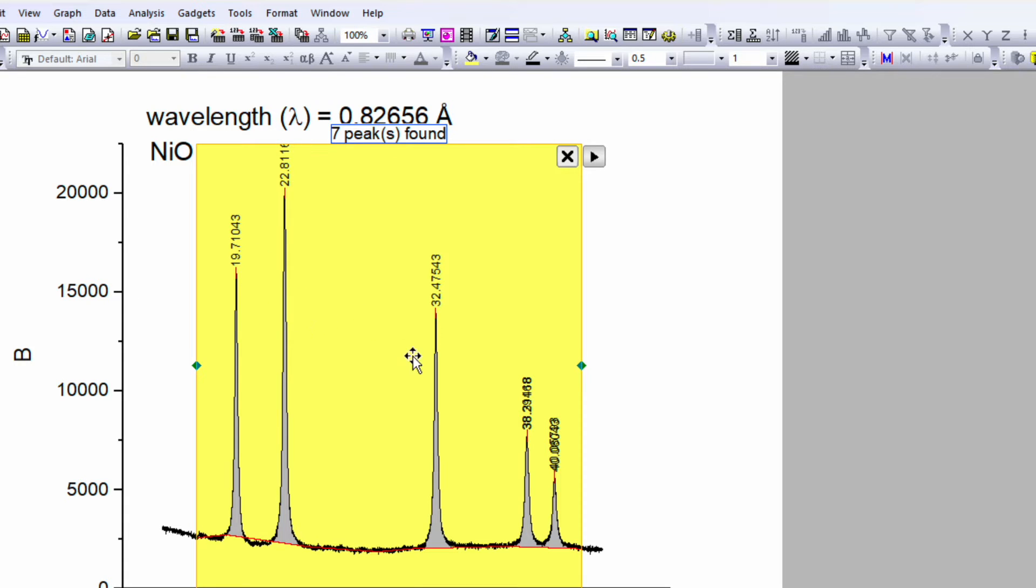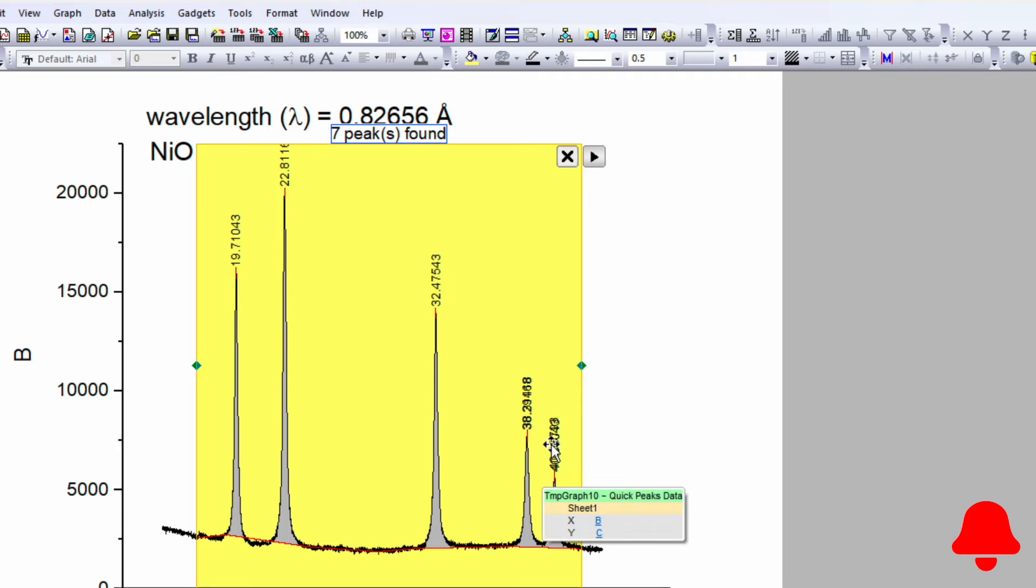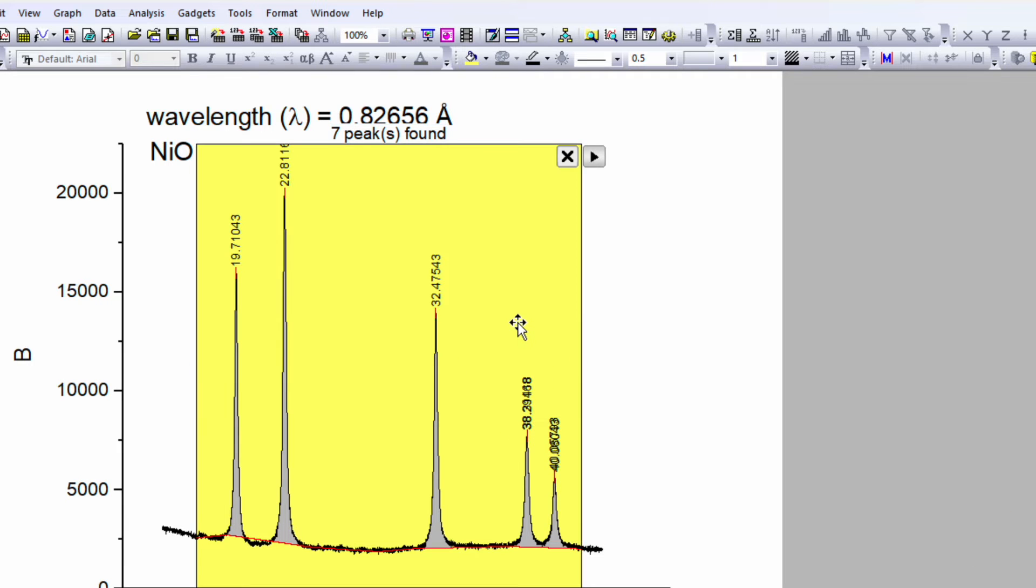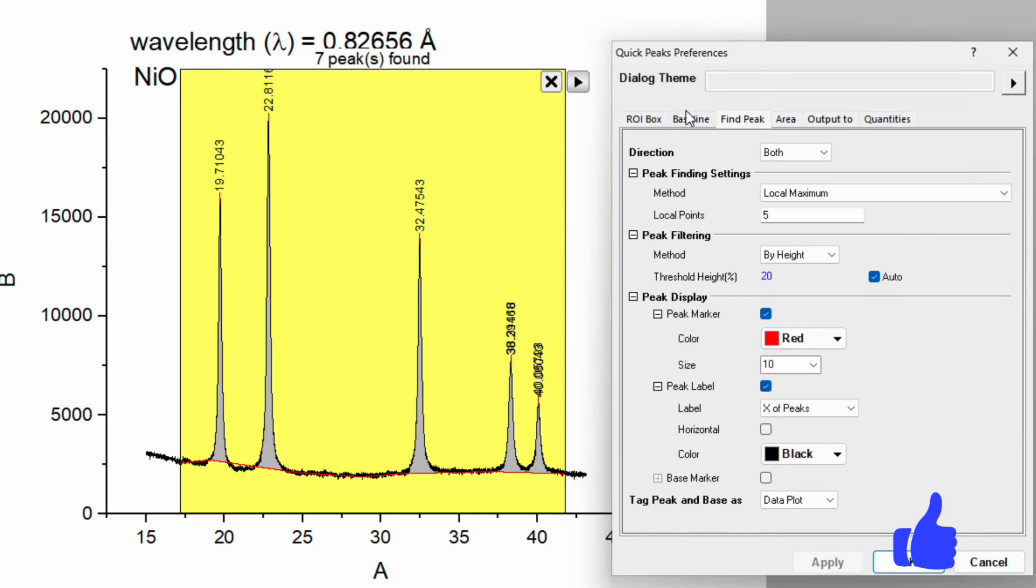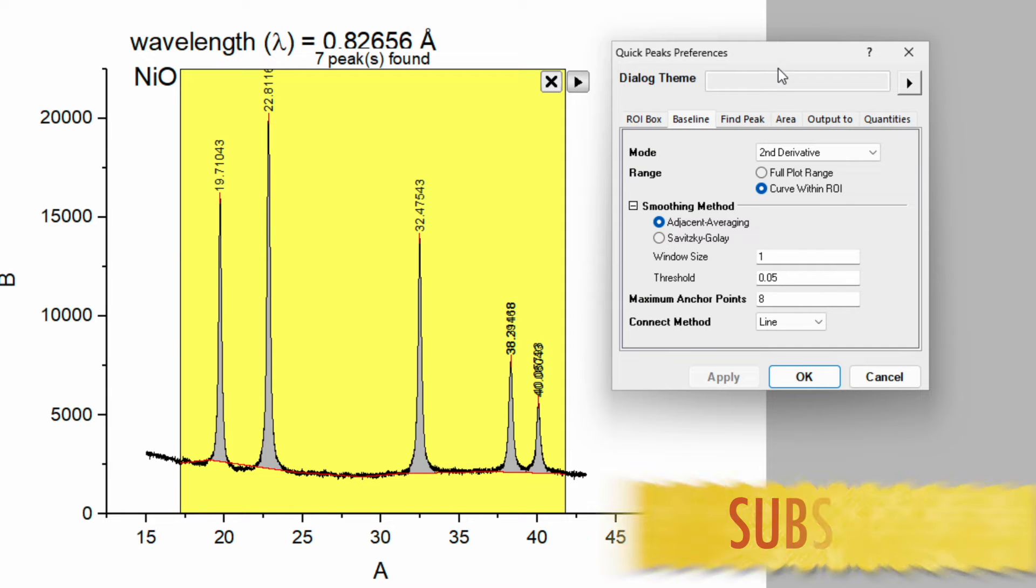You can see the peak center for these three peaks, whereas for these two peaks there is some overlapping. So just double-click on this shaded area. First go to the baseline.